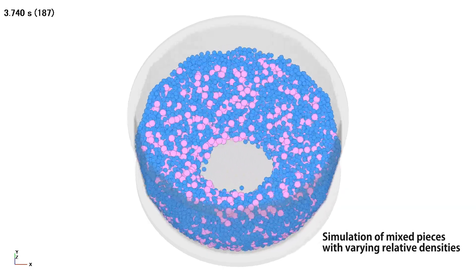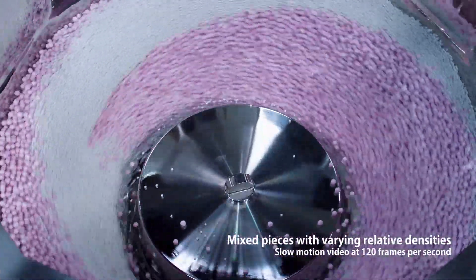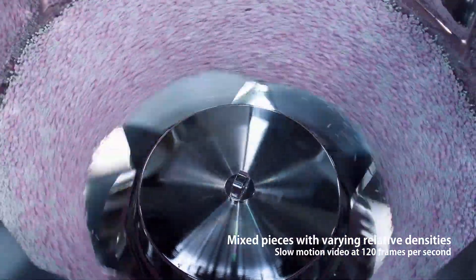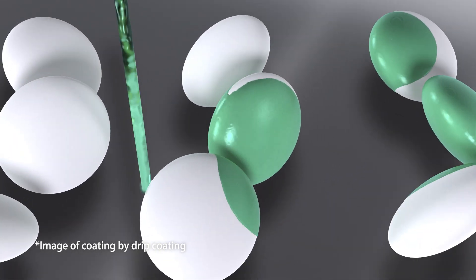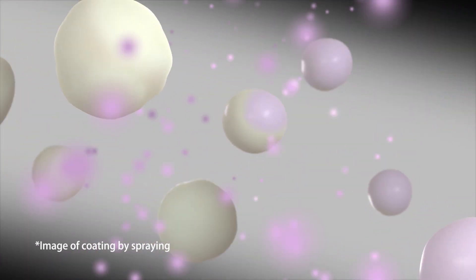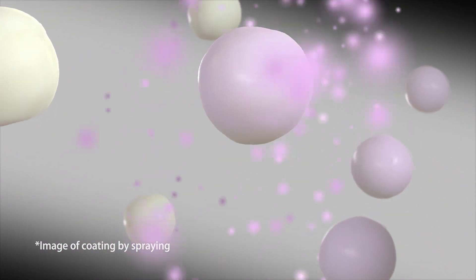The strong stirring capability of vortex flow allows uniform mixing without separating centers with varying relative densities and sizes. Drip coating is good for large centers like pills, while spray coating is appropriate for small centers like powders. But with ECX, uniform coating can be quickly applied to either type of center with the stirring capability of vortex flow.